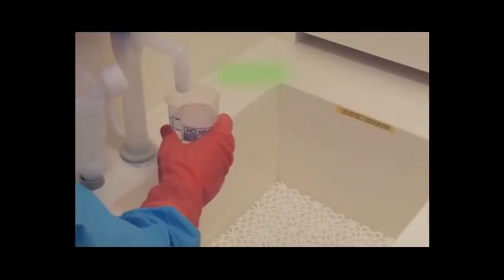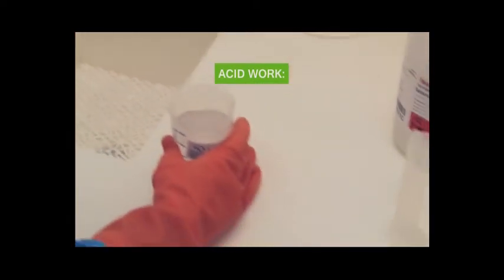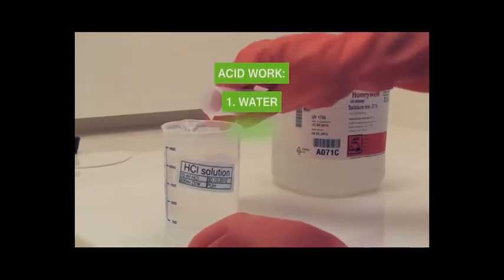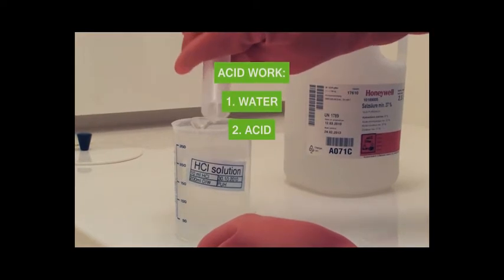When making acid water solutions remember this rule: first water, then acid. This is extremely important especially when working with sulphuric acid since it reacts very strongly with water and will splash into your eyes when you add water.